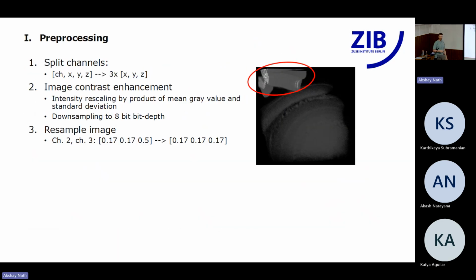So what does labeling a synapse mean? Is it segmentation? Sorry, labeling of the synapse? So what I mean by labeling is that the brain is treated so that a specific fluorophore is attached to the synapse, so that later when we image this optic lobe, the synapses are actually going to light up and they're going to be visible in the image.